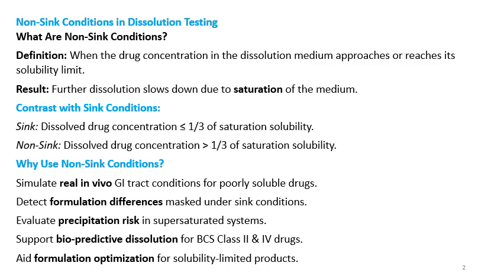Non-sink condition in the dissolution testing: first we need to check what is the sink condition. If your medium and medium volume can dissolve at least 3 times of the dose of the formulation, or you can say the highest strength dose, then you can say that the dissolution medium is meeting the sink requirements.